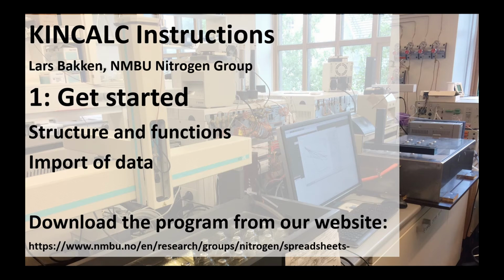It takes some time to grasp the structure of KINCALC and to use it efficiently. Thus these instruction videos. The present video is the first in a series that will enable you to get started. It gives a brief overview of the structure and instructions on how to import data and to put the right information into the spreadsheet. Before plunging into the spreadsheet, let me give you an overview of what it does.